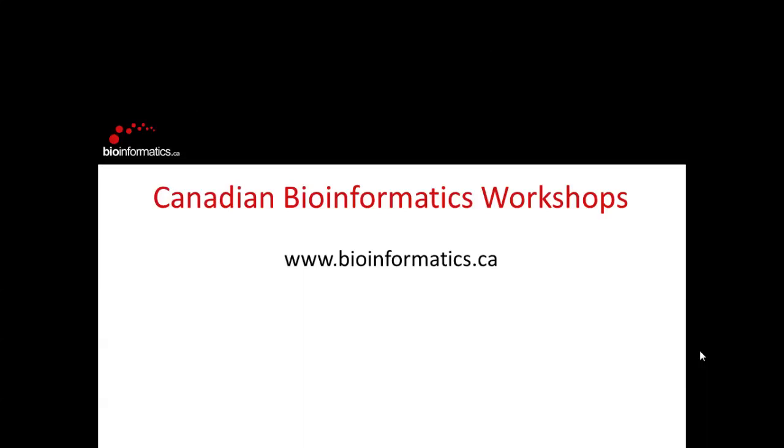So, I'm a principal investigator here at OSCR. I started my lab about 5 years ago, a little bit less, and my team is basically looking at using omic technologies to develop biomarkers that predict how we should treat different patients. And in some sense, we use any omic technology, really any large data set that we can get our hands on. And we're going to spend today talking about microarrays.